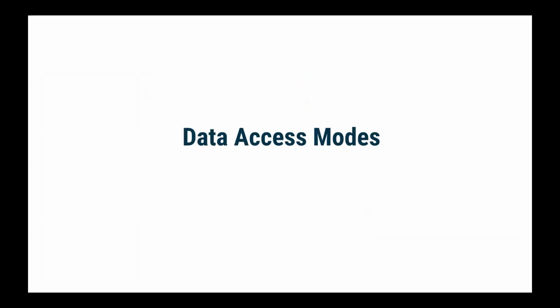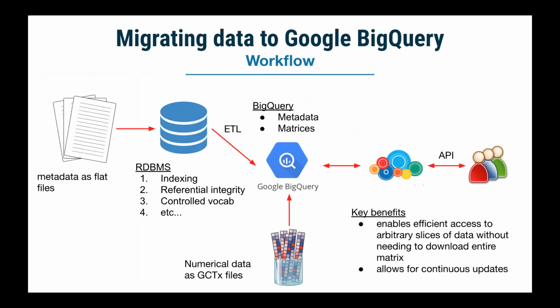So there's a lot of discussion about the data there, but I think probably it's very useful to talk about how to actually access this data. So we've recently migrated our data over to Google BigQuery, which is a highly performant data store hosted by Google. And this is not a total transition from, but an augmentation to the previous methods of storing data, which were in flat files, text files, and GCTX files, which some of you might be familiar with, which are essentially annotated data matrices.